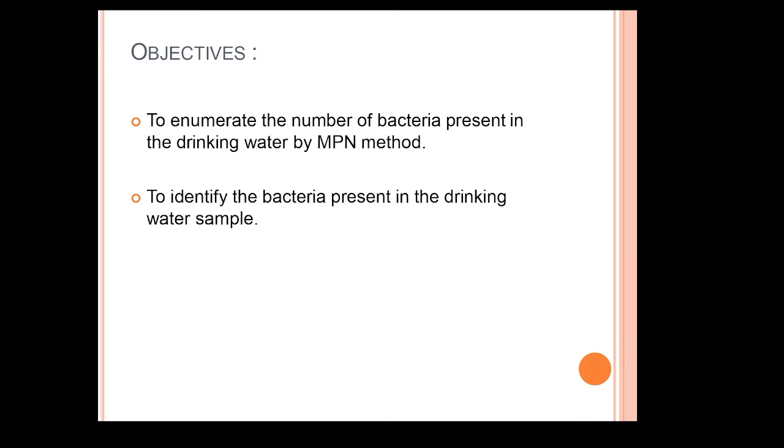Objectives: to enumerate the number of bacteria present in the drinking water by MPN method, then to identify the bacteria present in the drinking water sample.